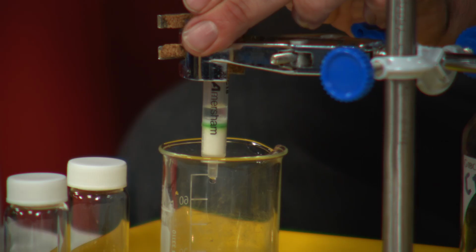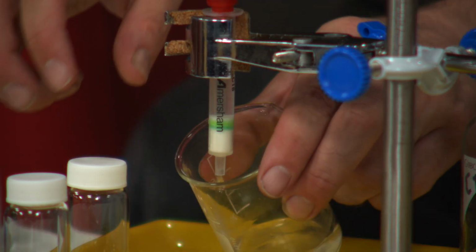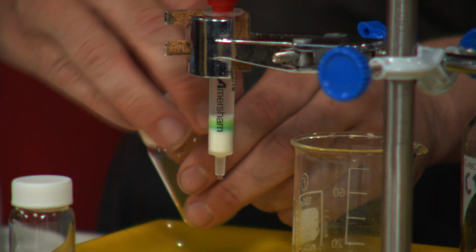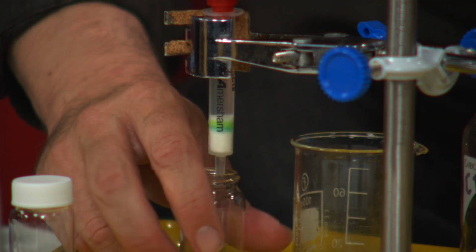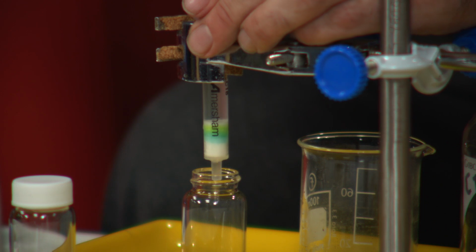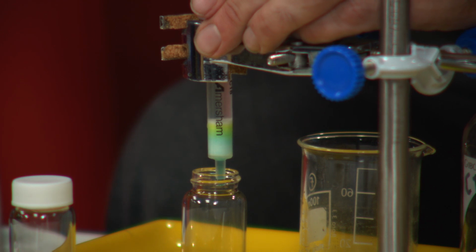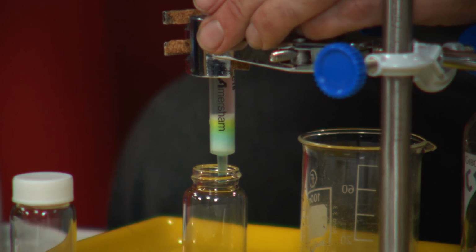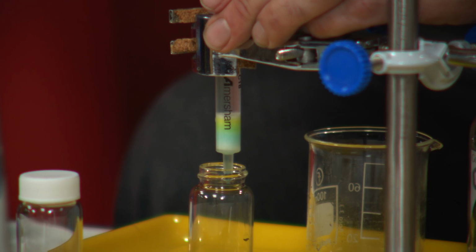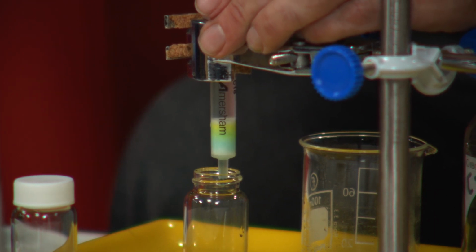Okay. There we go. And then we should really switch these over, so I will, so you can collect the solution that we're interested in. So hopefully, if you can see, you're getting that nice separation at the bottom there. There's the blue colour, the blue solution is being pulled off, and the yellow stuff is staying attached to the column. So you can push that through really neatly.